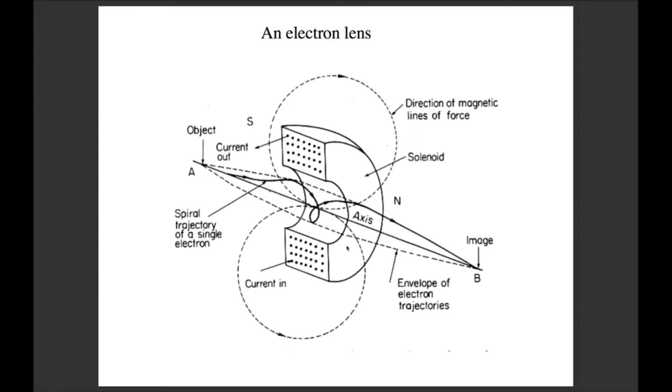Something else that's particular for a TEM lens is that your sample is more or less in a fixed location. You have some play, but your lenses are pretty much fixed, and where you're projecting is fixed. So our microscopes aren't continuous magnification microscopes. They have set magnifications, and usually those magnifications from the manufacturer keep the image in a reasonable rotation where it's always in a particular direction. You can get additional lens series that give you intermediate mags. In that case, you'll note that they'll be rotated, so you might see an object in one mag and in another mag it will be rotated.